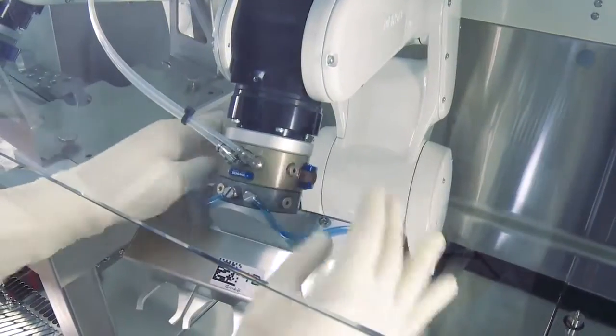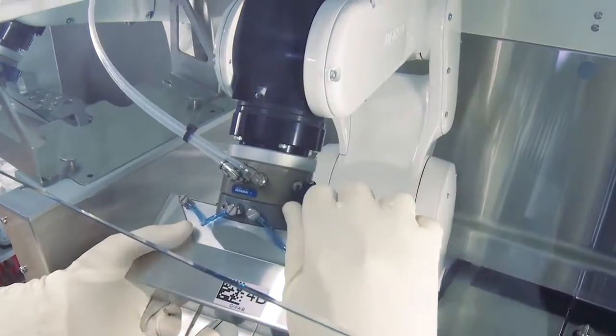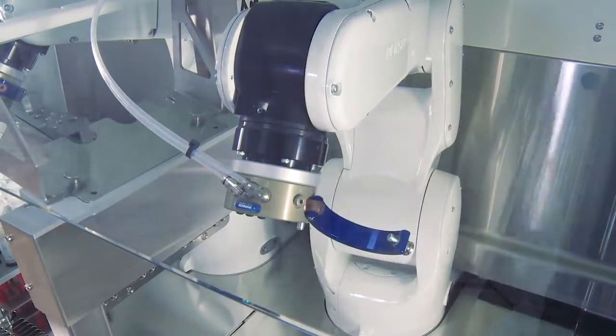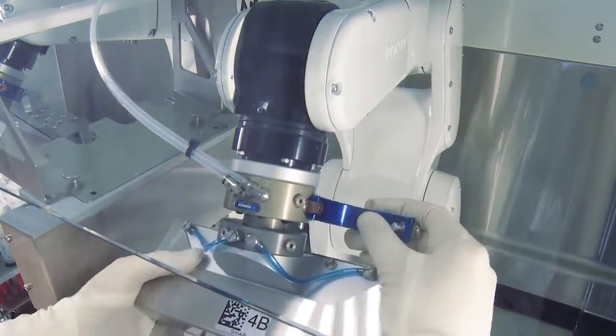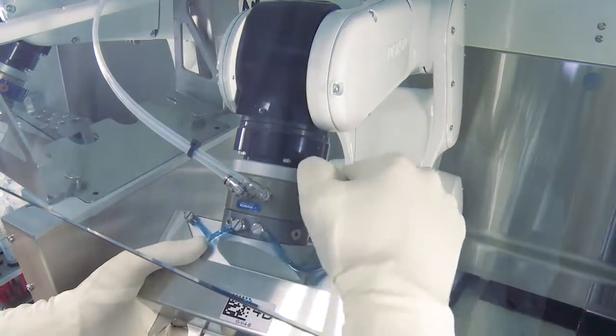Due to its easily replaceable parts, the device can be adapted to user needs and installed in a clean room instead of an ordinary biosafety cabinet.